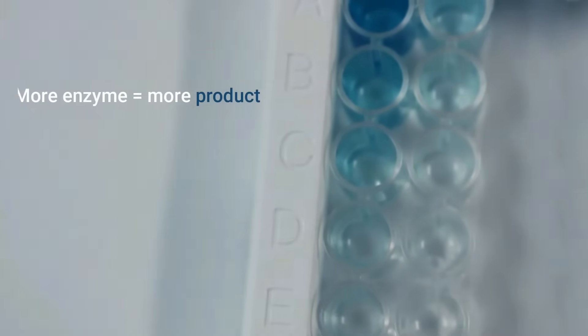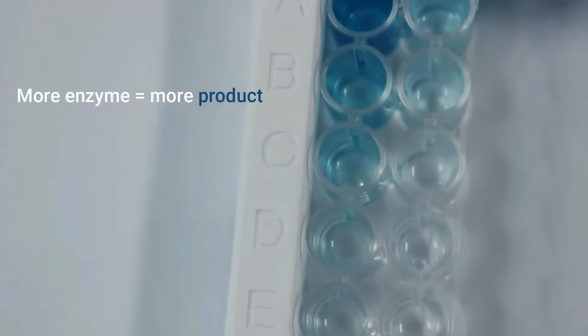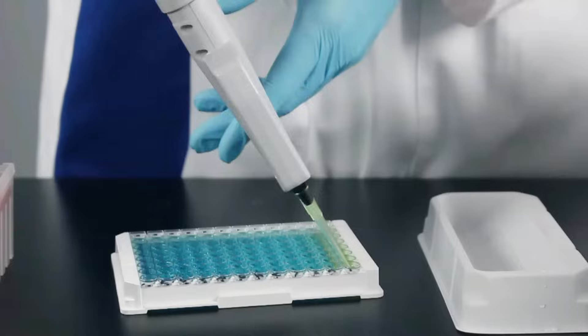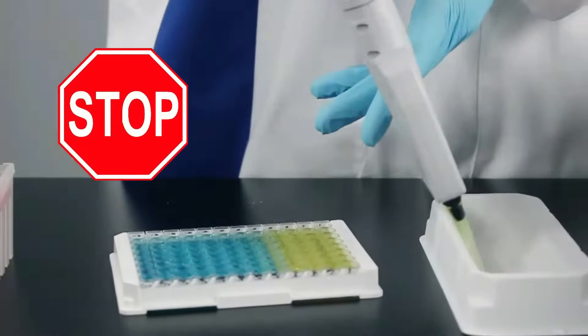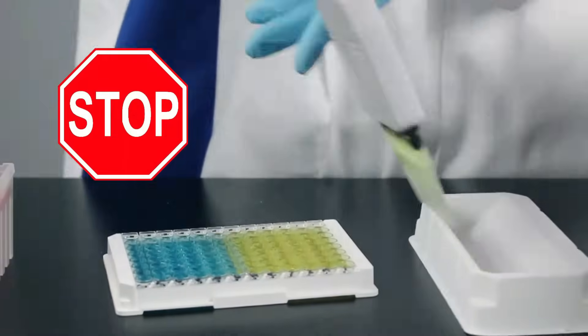That blue intensity will be directly related to the concentration of antigen in the sample. To stop the reaction, we have stop solution, which is dilute sulfuric acid.